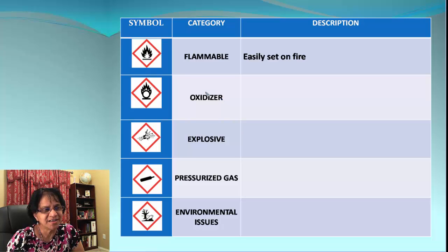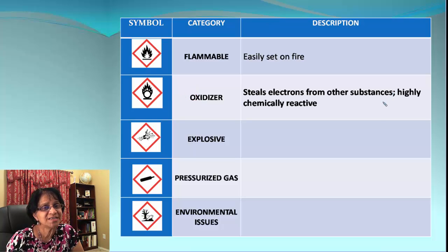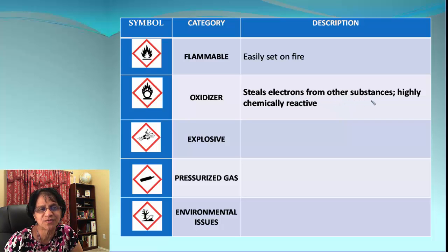The next one is oxidizer. The GHS symbol for oxidizer looks almost similar to flammable, except if you look carefully it has an O inside — that O stands for oxidizer. These are chemicals that can still set a fire. They actually steal electrons from other substances and are highly chemically reactive.